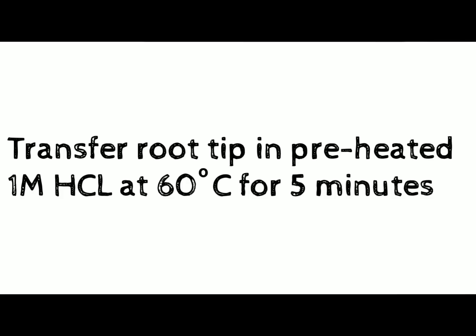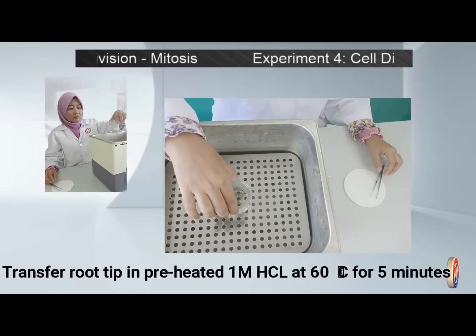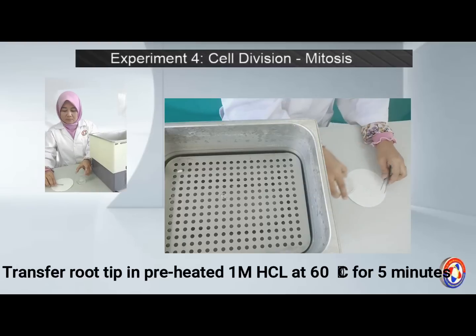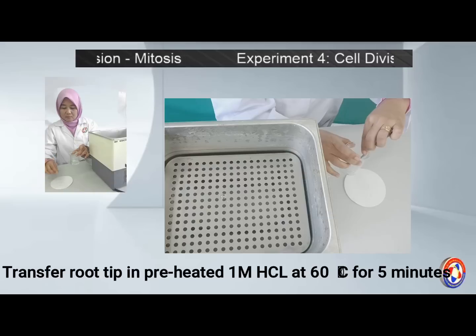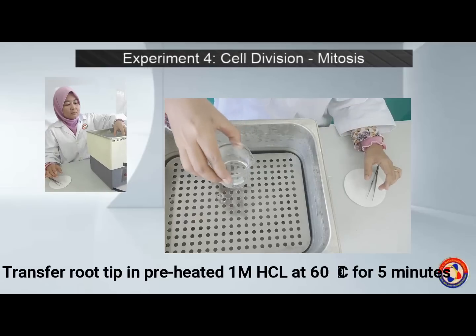Next, transfer the root tips to preheated 1 molar hydrochloric acid at 60 degrees Celsius for 5 minutes. The hydrochloric acid should be prepared first, so you can start heating it while the root tips are immersed in acetic alcohol.